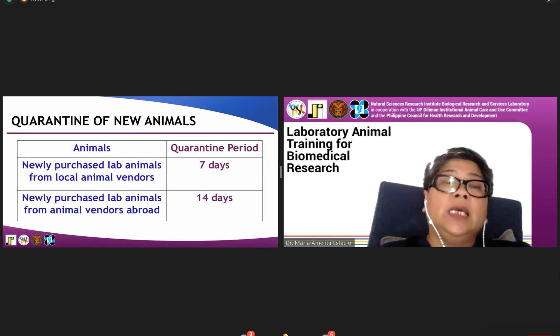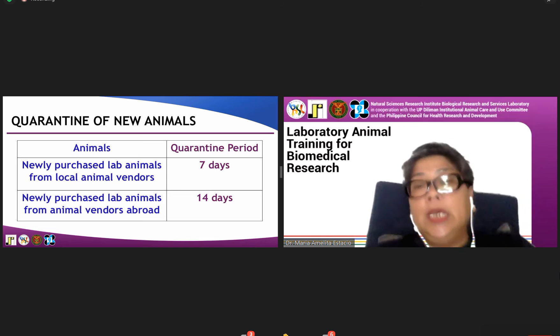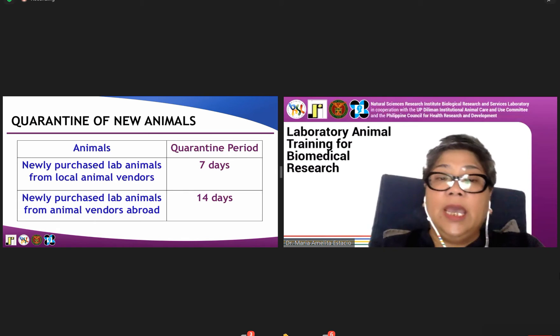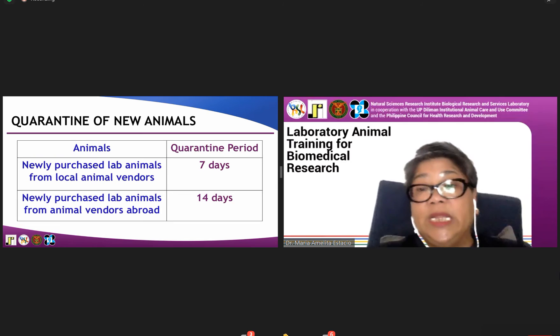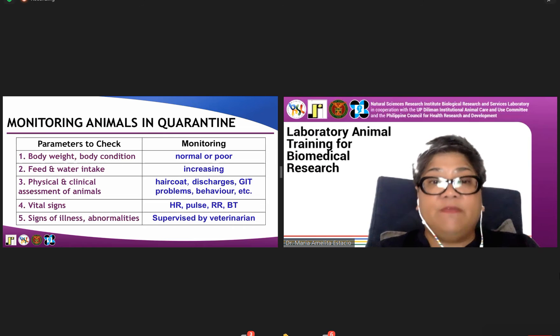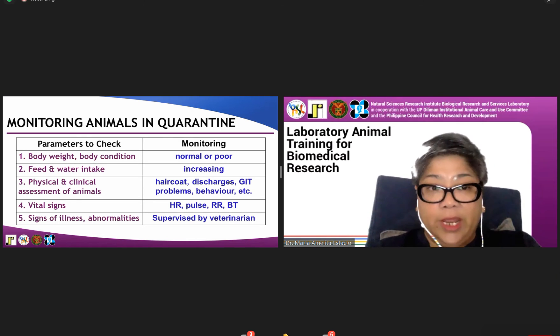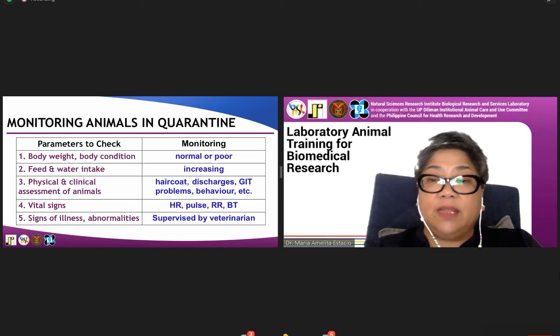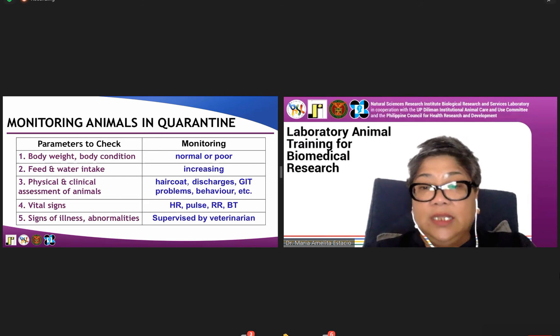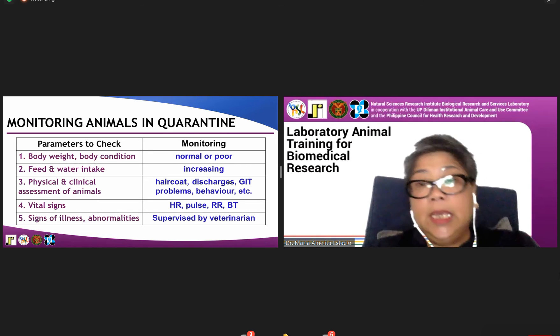For purchasing of animals, you need to quarantine them whether you buy locally or from abroad. Local animals require a seven-day quarantine period so they can acclimate to the new environment prior to use. Animals from abroad require a 14-day quarantine period. Monitoring is the role of the lab animal caretaker and facility veterinarian, who check health parameters such as body weight, body condition scoring, feed and water intake, and physical and clinical assessment. Only healthy animals should be used for any research purpose.